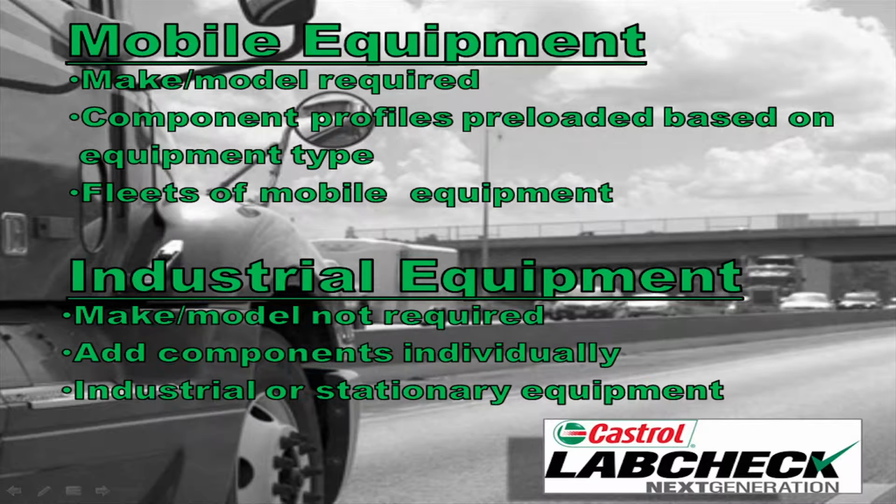Industrial, however, means the make and model is not required. Here you can free type and add components individually. Great for industrial equipment users. If you do not see one of these settings but would like access to it, please contact your site administrator or your Labcheck support desk.